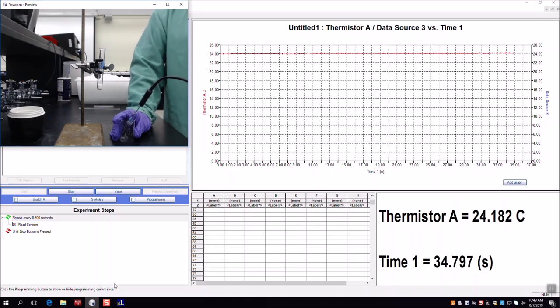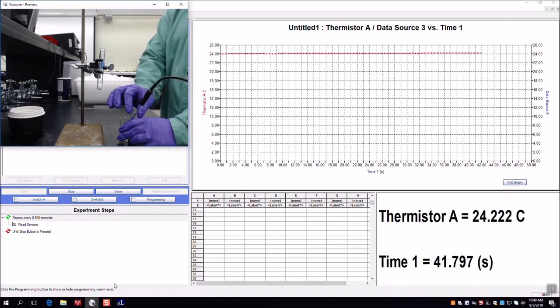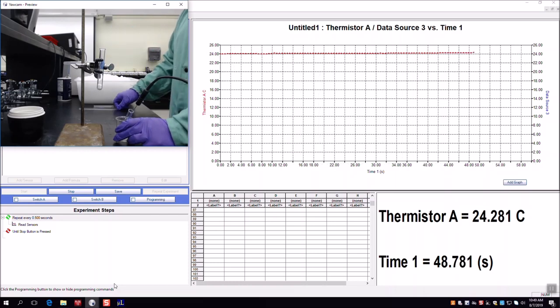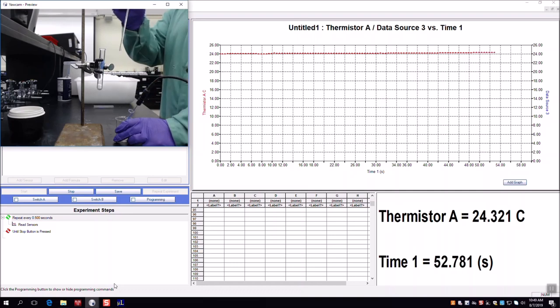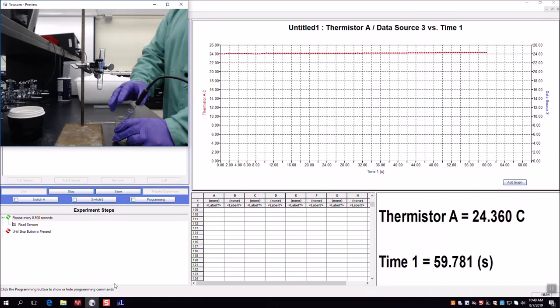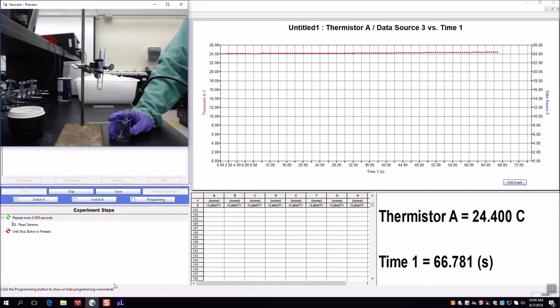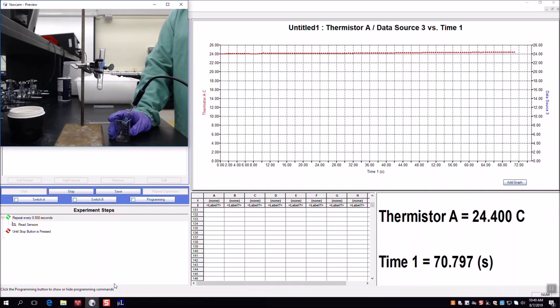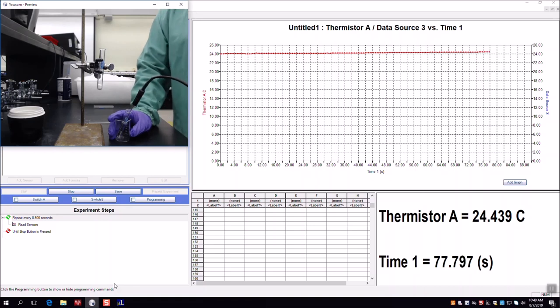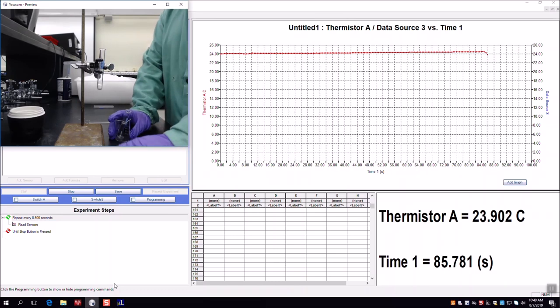Here's what I'm going to do: I'll take the thermistor out of the water, pour the water into the test tube containing calcium chloride, and then immediately take the thermistor and a glass stirring rod and stir vigorously. I want all the calcium chloride to dissolve as quickly as possible to capture the biggest change in temperature, which I'll measure as the heat of solution. If the thermistor temperature changes while it's out of the water, we'll ignore those points on the graph.